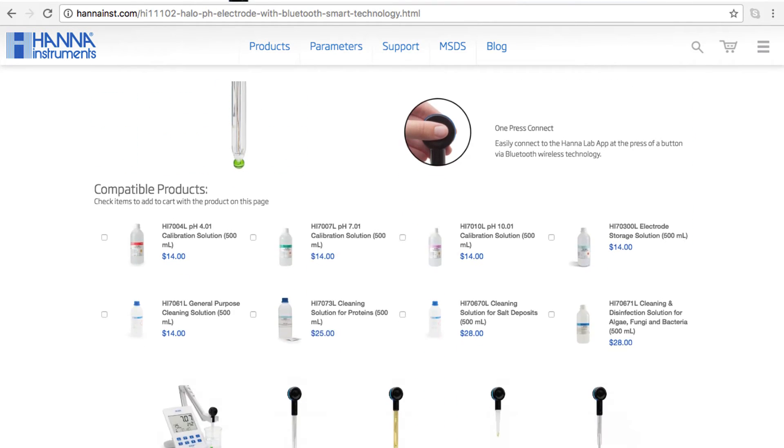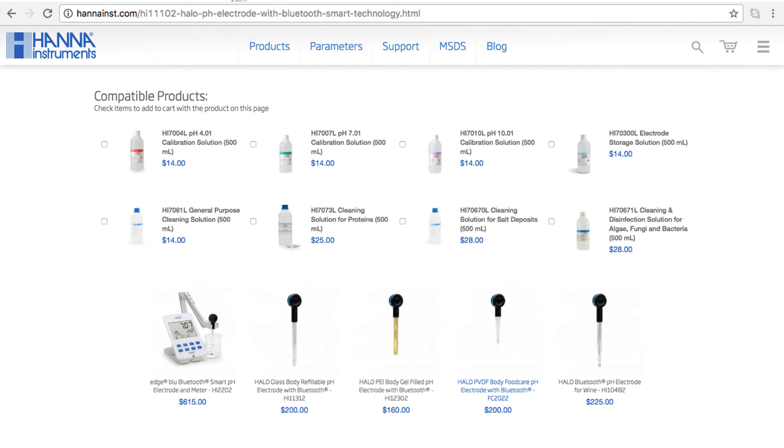So that's it! Our Halo wireless pH meter makes pH measurement easier and more accessible than ever. You can find everything you need for your Halo at hannahins.com. Buffers, solutions, and other products can be found right on the product page.